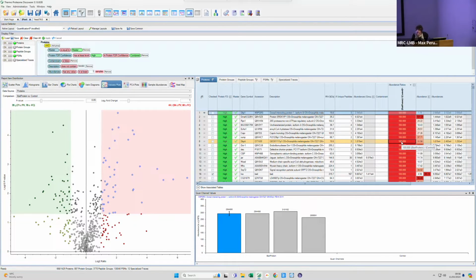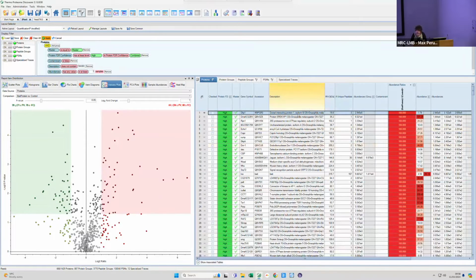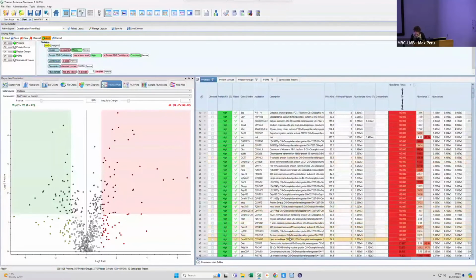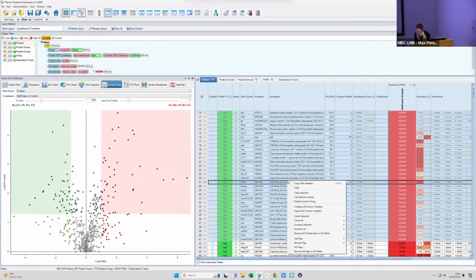And once you mark them, let's unmark these ones, uncheck all visible points. We don't want to look at this anymore. If you have questions, let me know. We can select for these proteins and you can check them all at the same time. A way to select all this data is you select them in a table and you can just go here, check selected in this table.